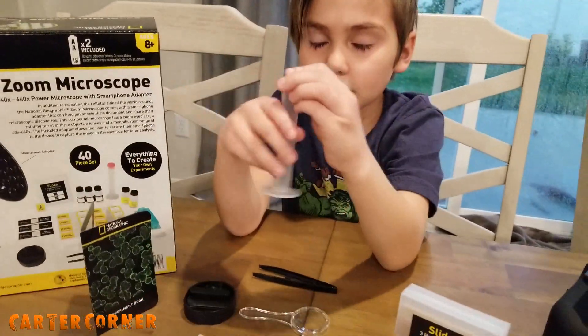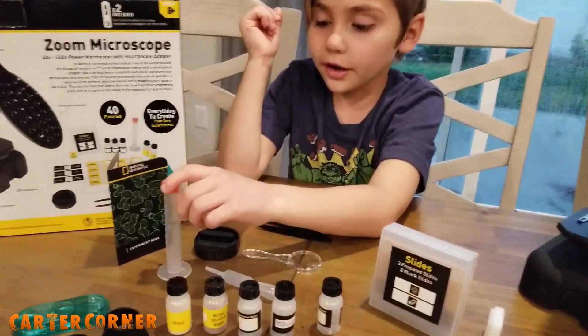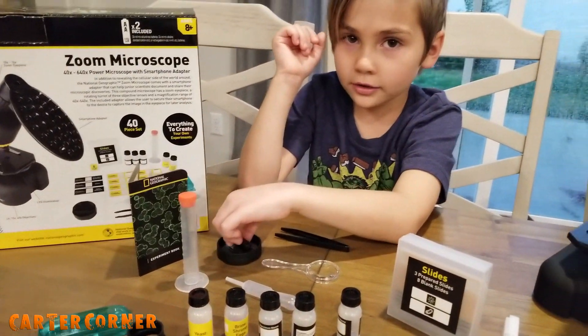This is the graduated cylinder — and no, it did not graduate high school.